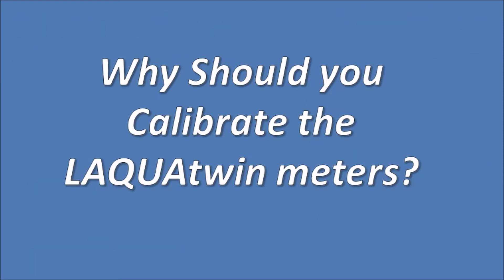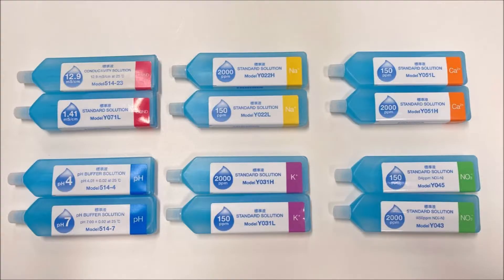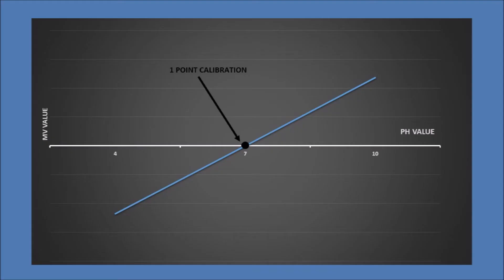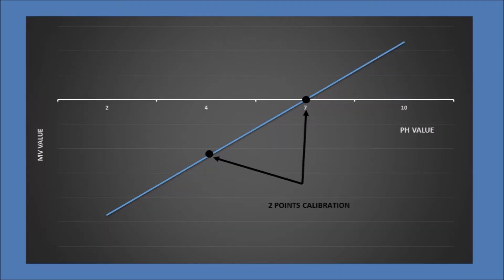Why should you calibrate the Laqua Twin meter? Frequent calibration ensures the precision of the Laqua Twin meters. The calibration uses standard solutions at known concentrations. Calibrations at a single point are quicker and easier, but have reduced accuracy when the measurement values are further from the calibration point. A two-point calibration fixes the calibration curve at both ends, providing better accuracy across the measurement range.